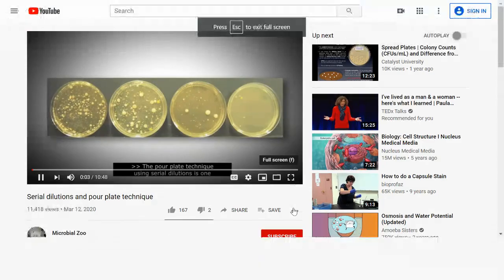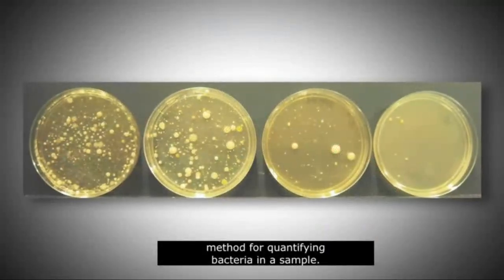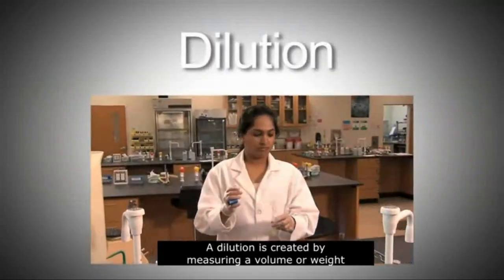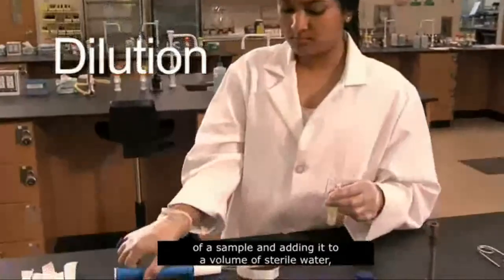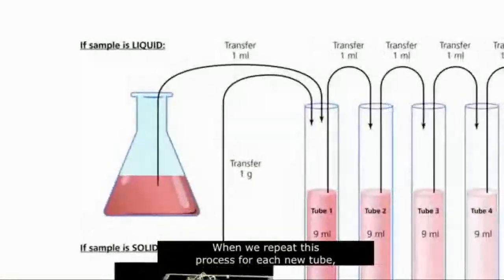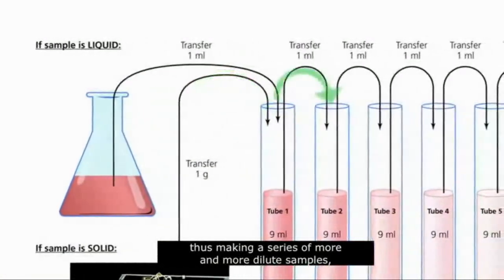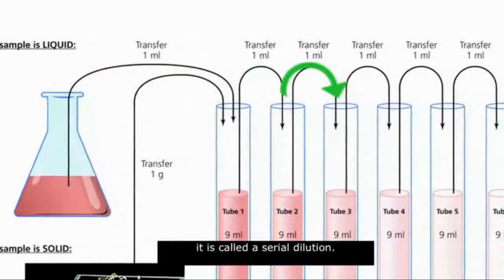The pour plate technique using serial dilutions is one method for quantifying bacteria in a sample. A dilution is created by measuring a volume or weight of a sample and adding it to a volume of sterile water, thus making the resulting solution less concentrated than the original. When we repeat this process for each new tube, thus making a series of more and more dilute samples, it is called a serial dilution.